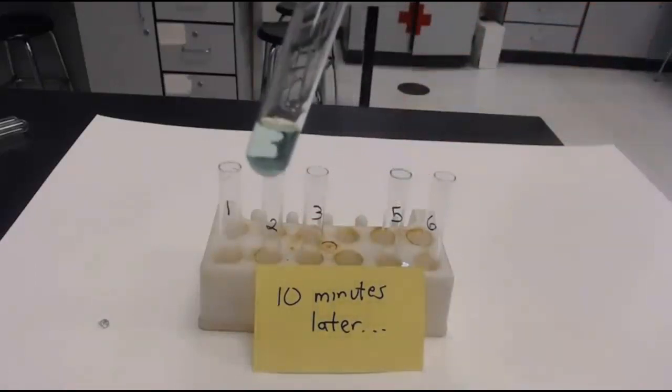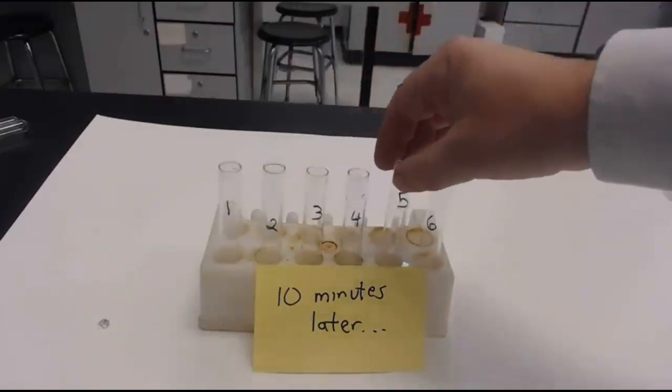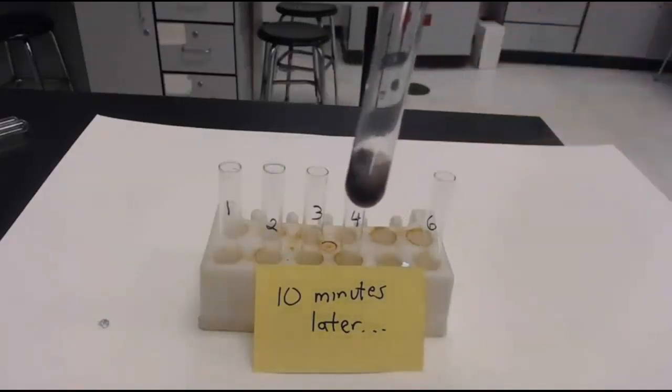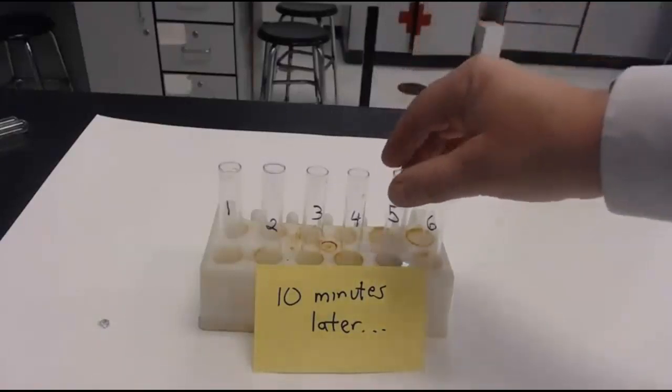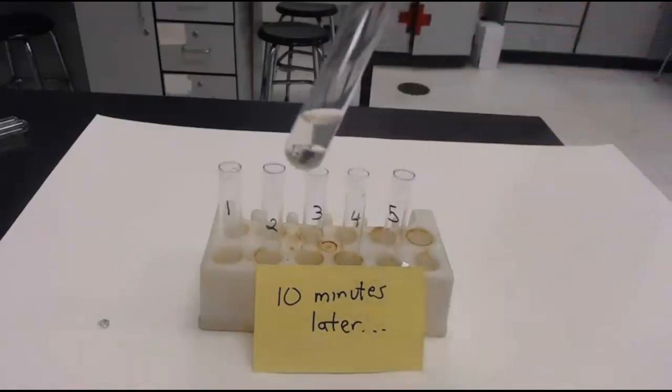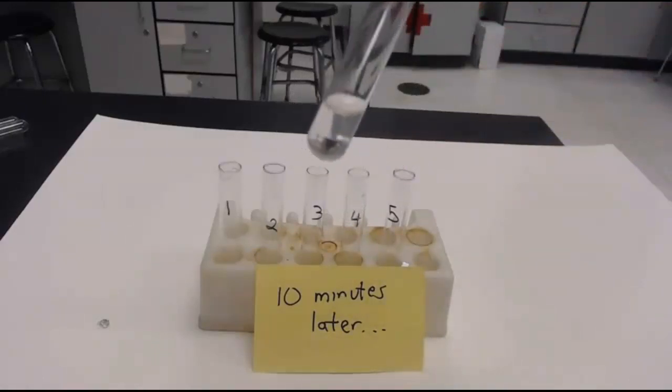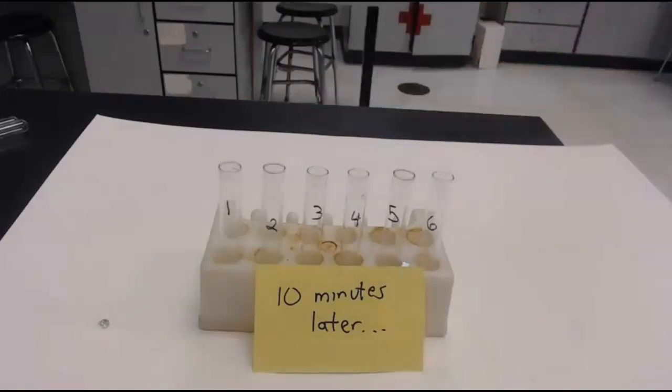This was a clear green liquid with a silver piece in the bottom. This, again, was a clear liquid with a silvery piece in the bottom. And this, of course, was the same thing. A silvery piece of metal. That little black thing is actually a shadow on the end.